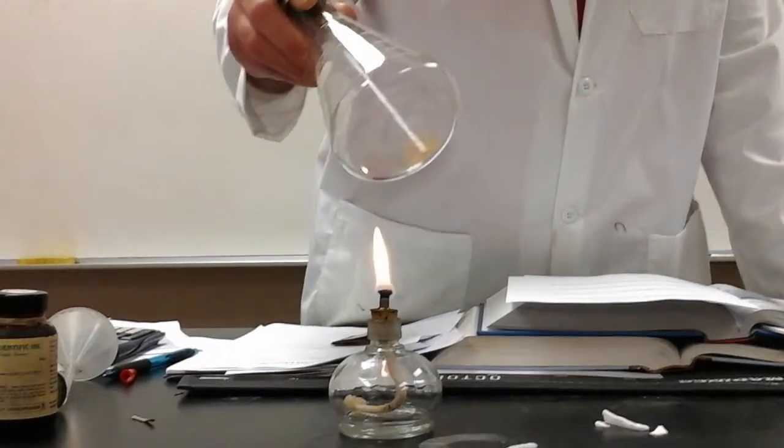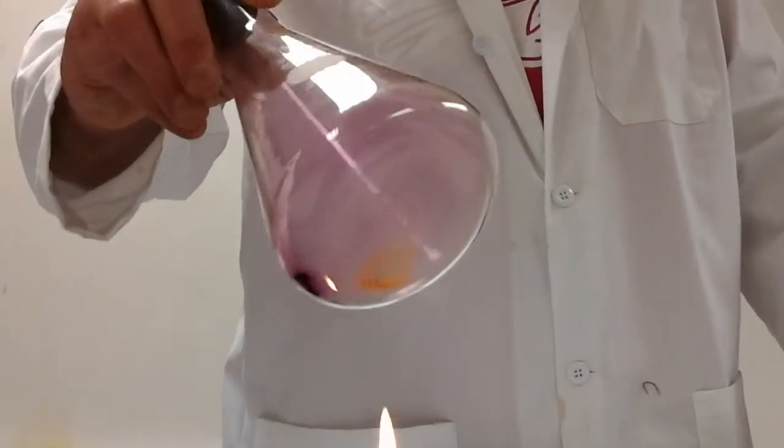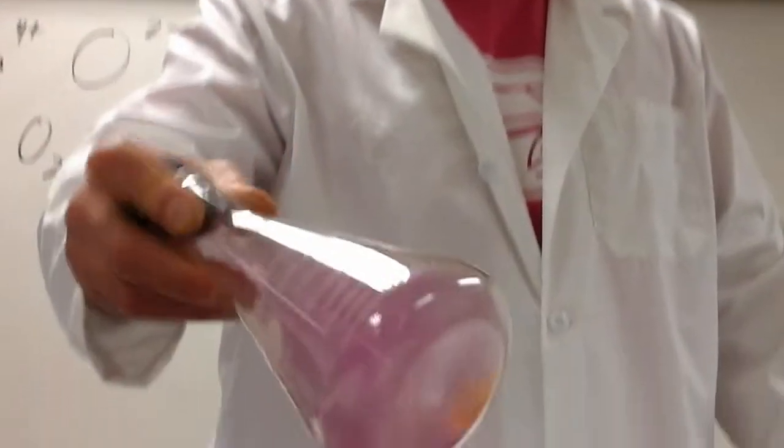Alcohol burners don't get very hot. It doesn't take very much heat for this to happen. And it's considered to undergo sublimation. Actually, if you look really close, it does undergo the liquid phase for a very short time period. But now you see this purple solid changing into a purple gas. Not all gases are colorless.